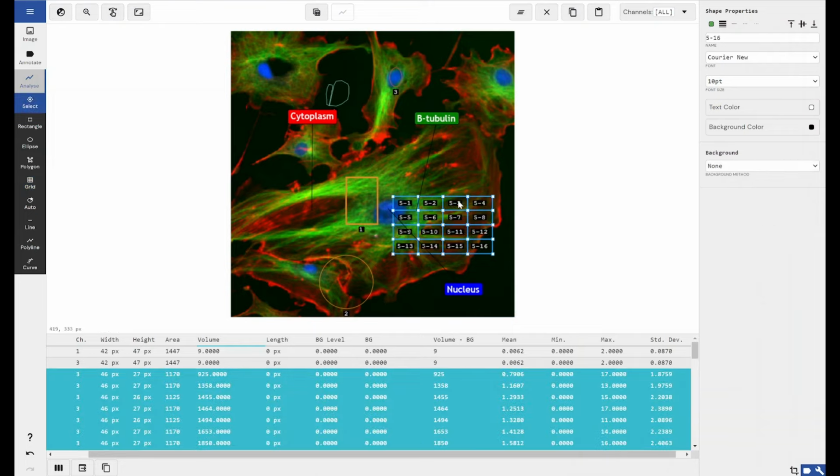Once you've fixed the grid in place, you can get all of the measurements for each of those grids, and then you can use the select tool to change where the squares are in that grid, the size of the shape of the squares, sorry. So if you're using an array that is irregular, you can bend the grid around your array to make sure that you're still getting accurate measurements. It doesn't enforce an extremely horizontal or extremely vertical grid.